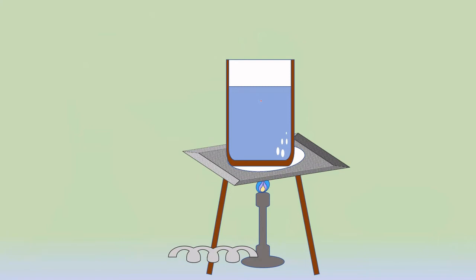On the top of that beaker, you can keep a 100 ml beaker, and on the top of that, you can keep this watch glass. Continue this process till you get the dry product. With the help of the spatula, you can break down those lumps which are formed, so that the drying process will be faster. In this process you will completely dry the product.